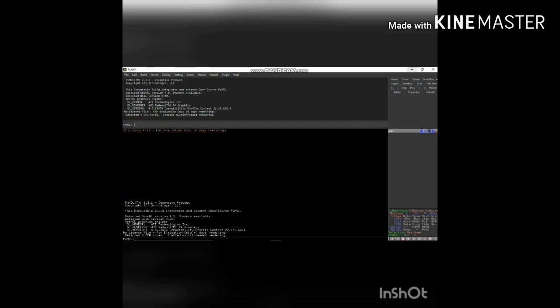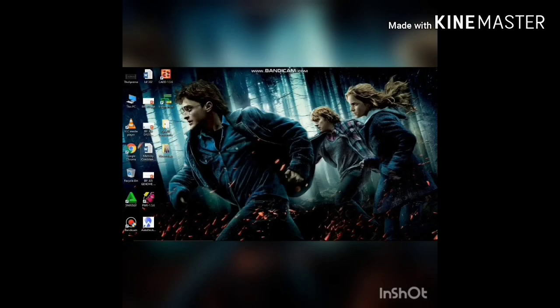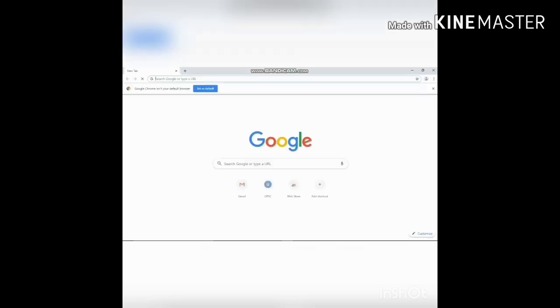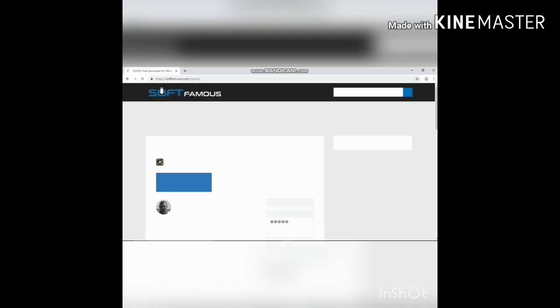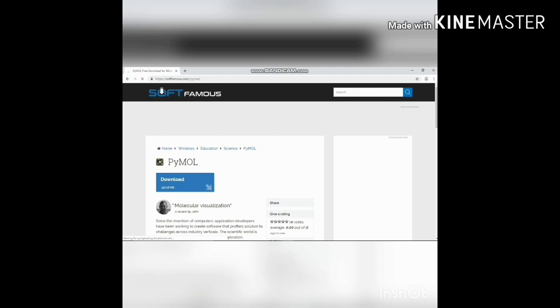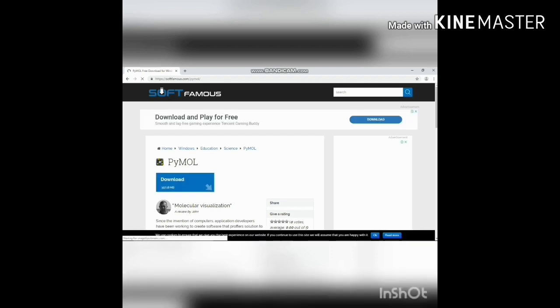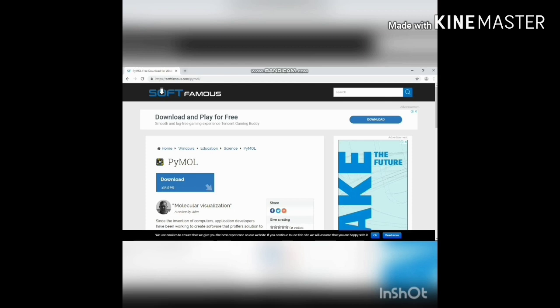Let's see how to install the PyMOL software on your system. Go to your browser and type PyMOL. It can accept only the 64-bit Windows operating system. Click the free download option and it will show the download page. Then click the download option — it will easily download since it is open source software.